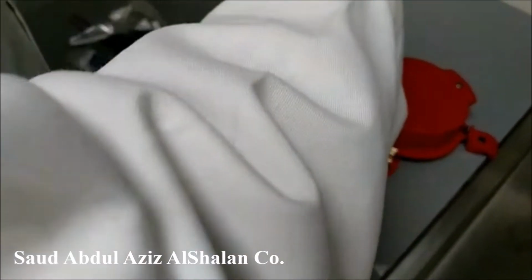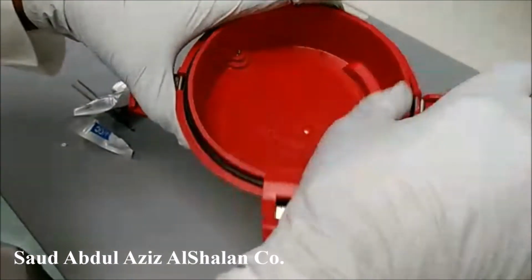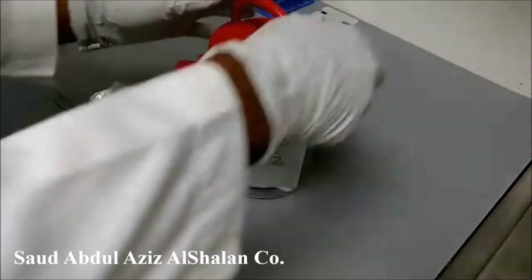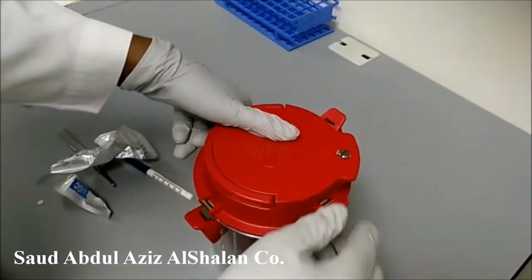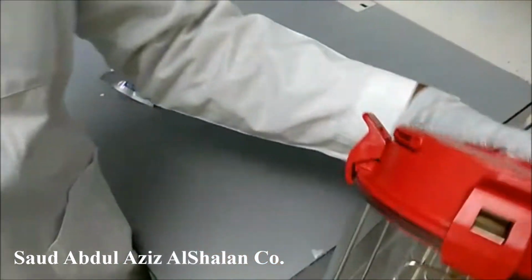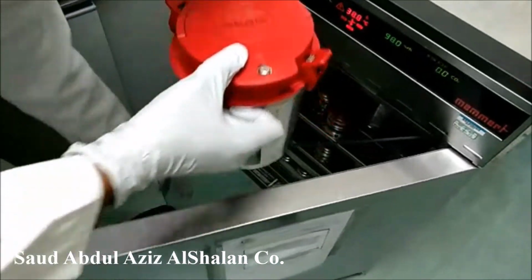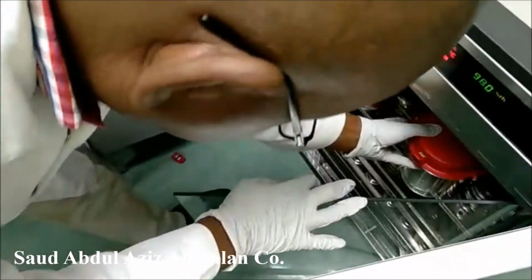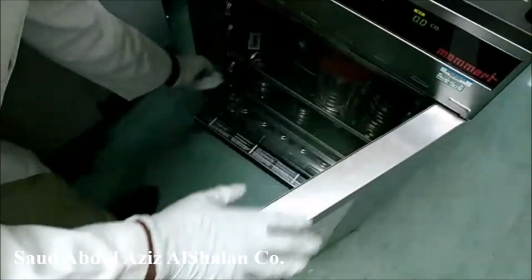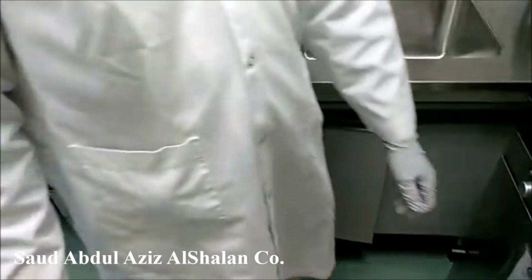We will put this on and close our jar, and we will incubate it at 37 degrees for 7 days. And now we are done with the processing.